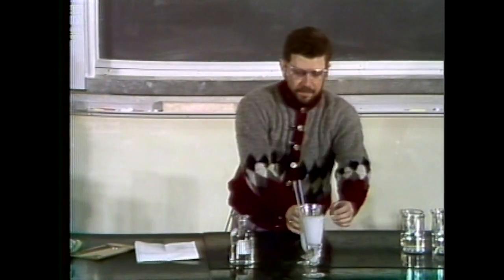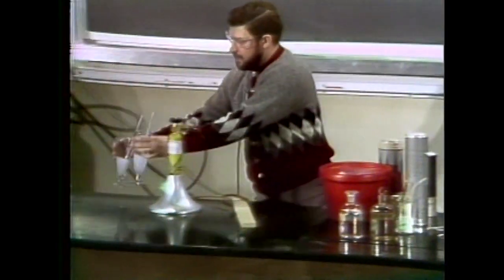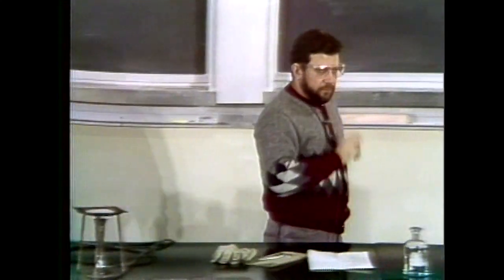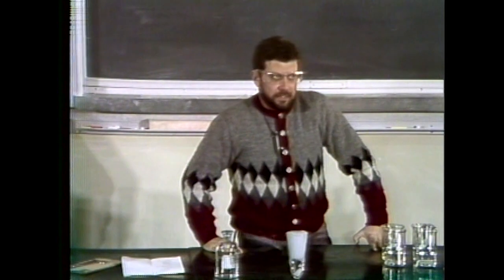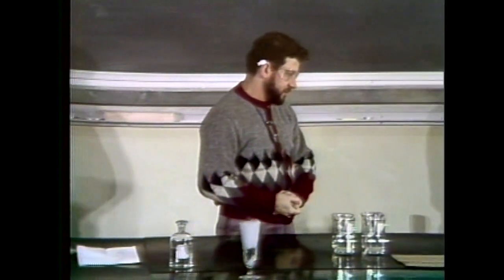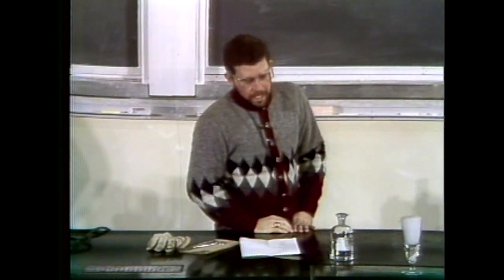The systems that we will look at today, as I mentioned before, deal with the nitrogen and oxygen gases in the liquid state. And so what we're going to do is look at a temperature scale now, just to give us a fix as to what range of temperature we're looking at.